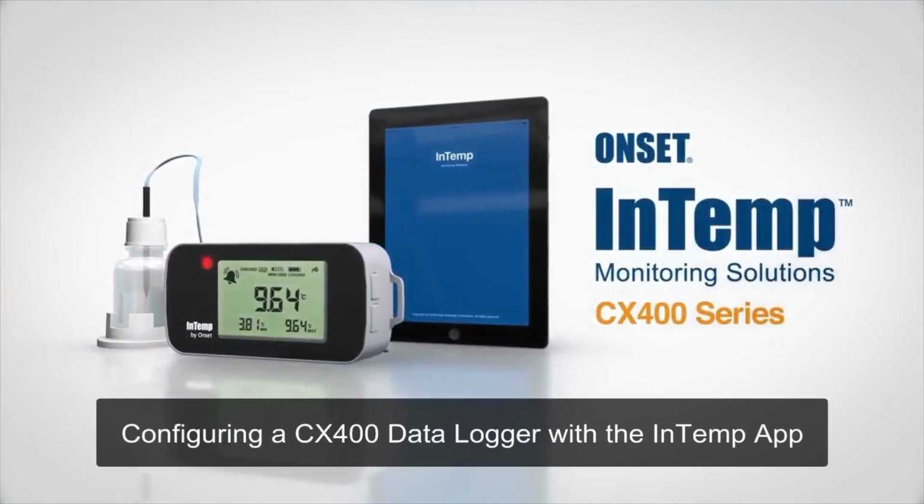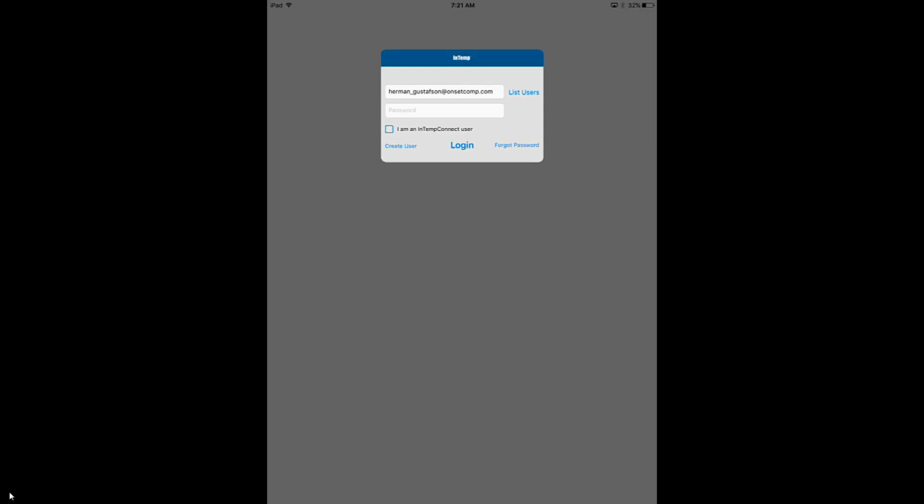Configuring a CX400 logger with the InTemp app. To configure a data logger for use, to log data and so we can create reports, we need to configure the data logger. There are some built-in configurations and we're going to go through those right now.